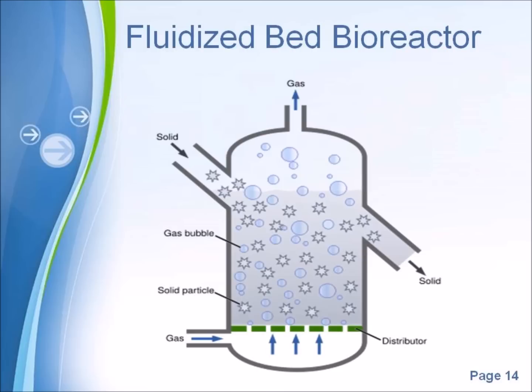First is the increase in porosity from the bottom to the top of the bed, and the second is the decreased particle movement when compared with beds containing particles of constant size. Since porosity or voidage is a measure of the local free space within a bed, it also represents a measure of the microbial hold-up when expressed as wet volume per unit bed volume. Thus, a variation in microbial hold-up is to be expected within a fluidized bed fermenter.